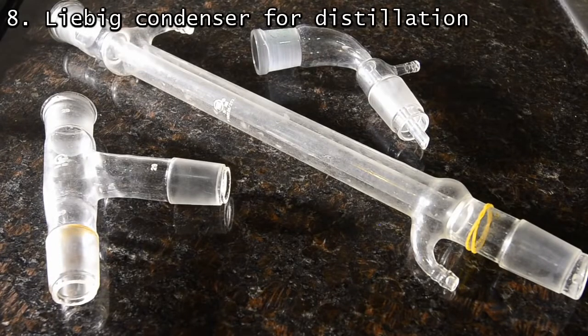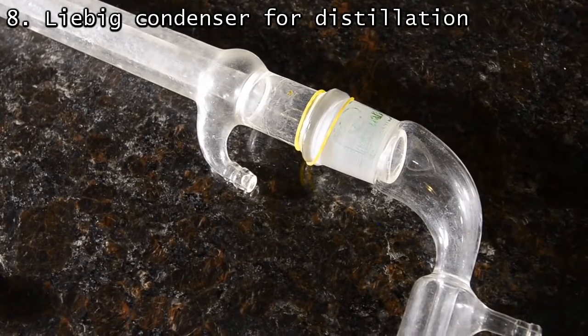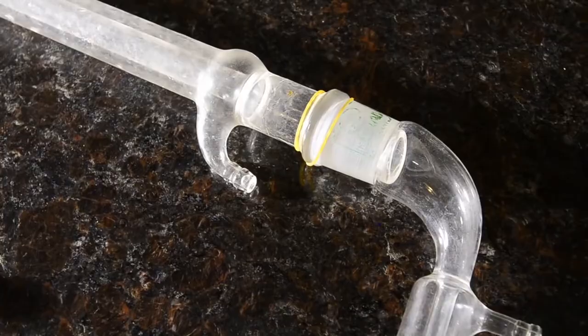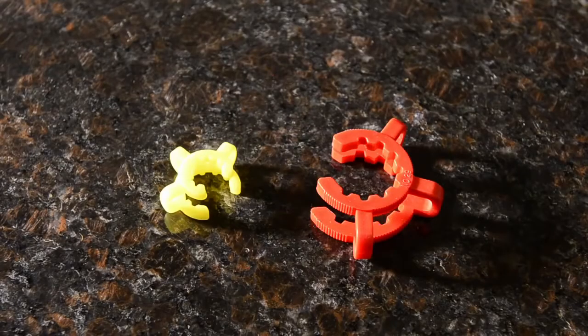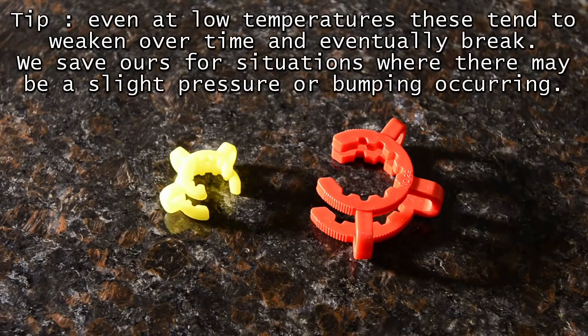Again, you can see that the joint size is the same. We also find that an elastic band works well on the end of the condenser to help secure the receiving adapter. We do also have some plastic Keck clips; however, in practice they don't last long as they are quite heat sensitive and slowly weaken over time.